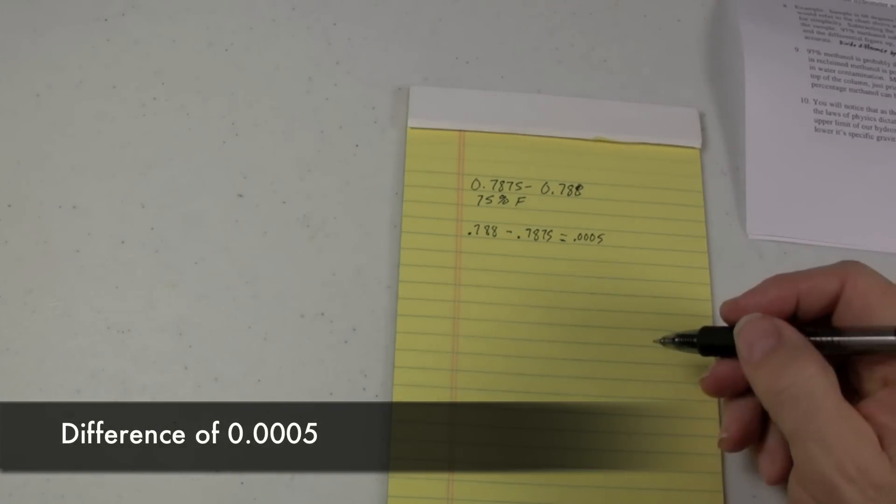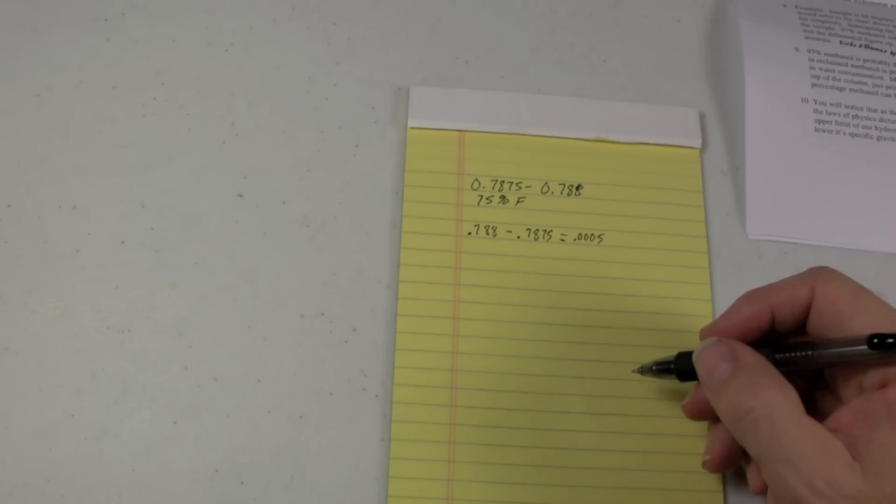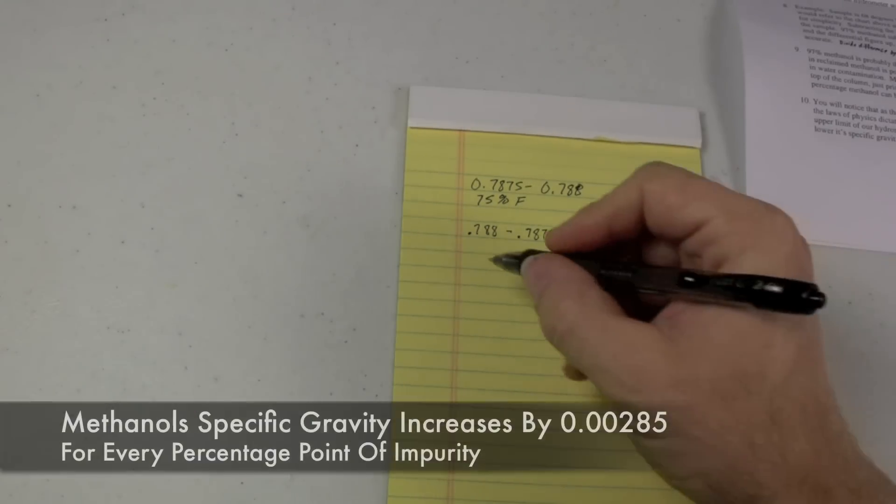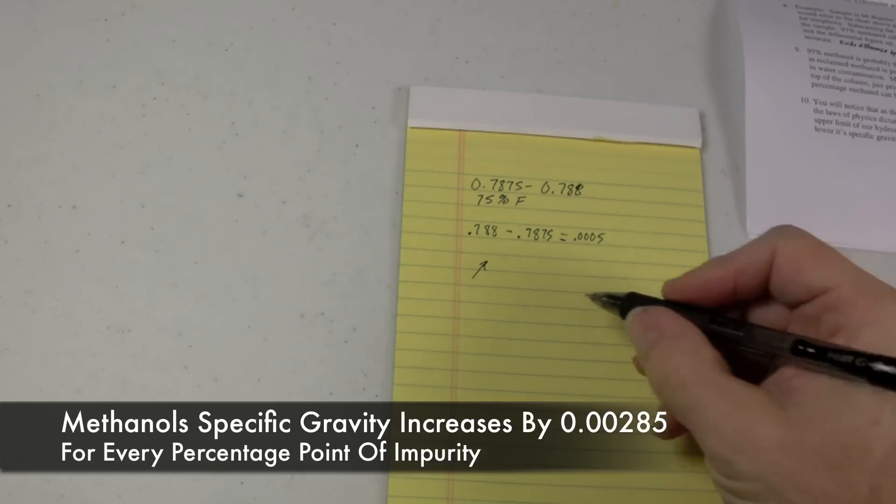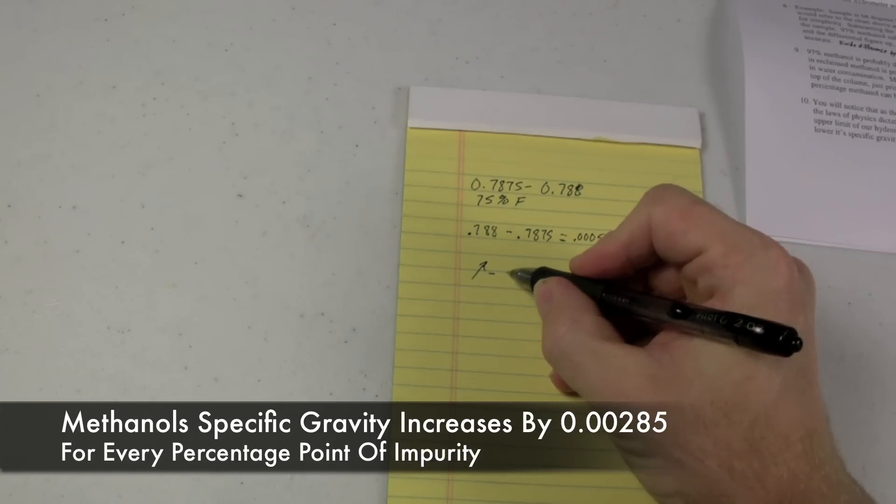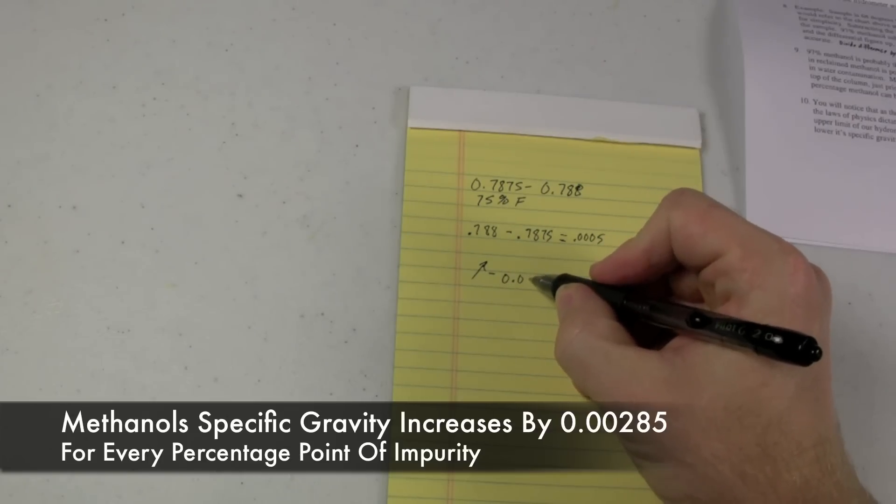Okay, methanol, as it becomes impure, for every percentage point of impurity in methanol, its specific gravity goes up by 0.00285.